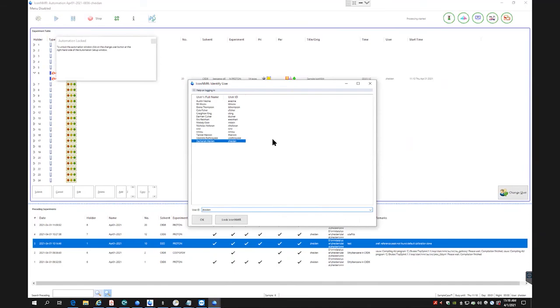I hope you guys see that this is a beneficial program and acquisition software for collecting your data. Thank you.